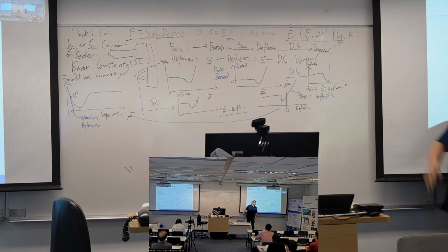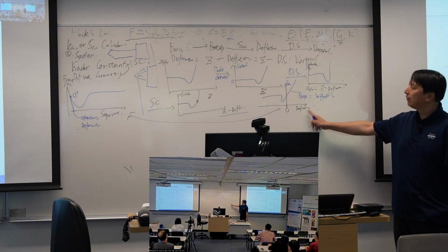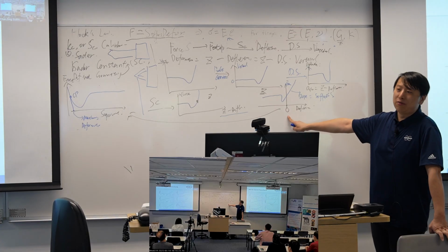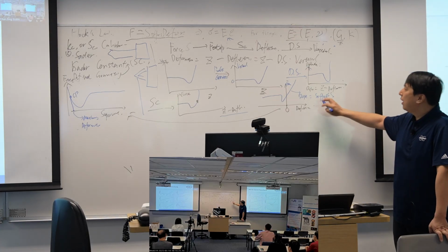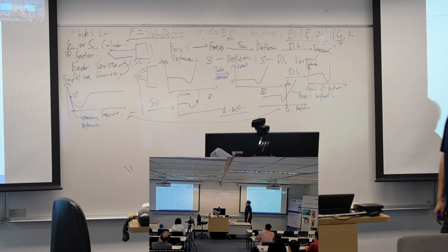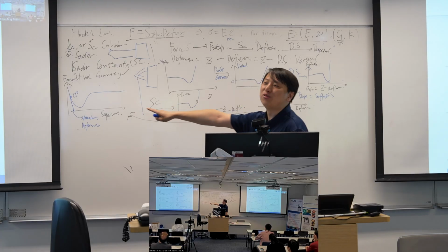So if you search back the references maybe 10 years ago, the scientists processed the force curve and they will stop here. You define the zero point of the deformation. That's it, and then you can get the stiffness out. But Bruker did some stupid thing. He changed it into this form.